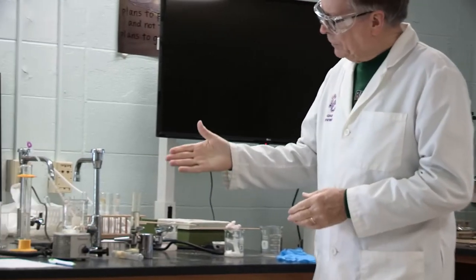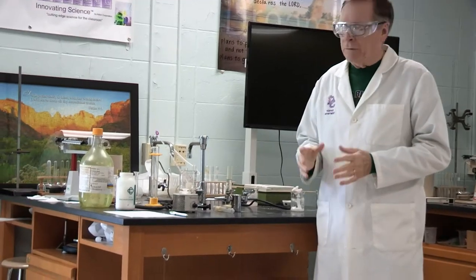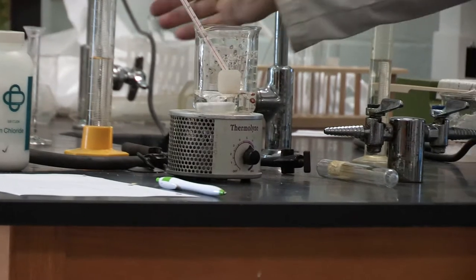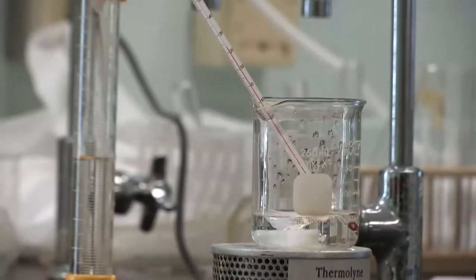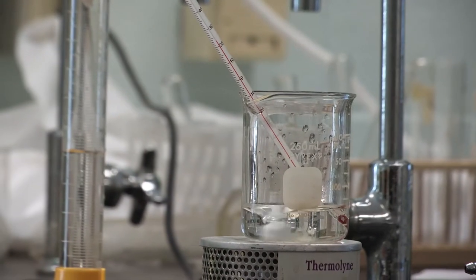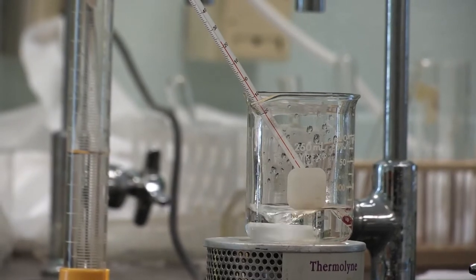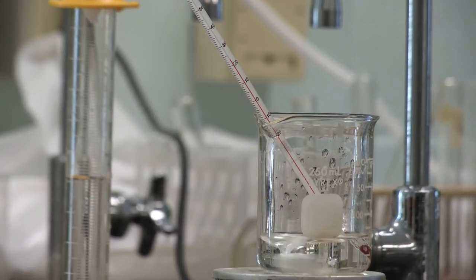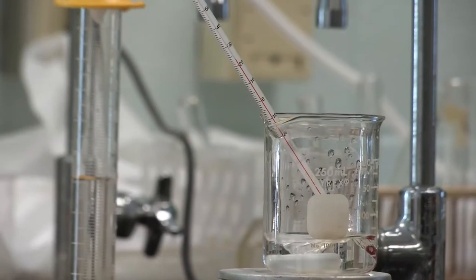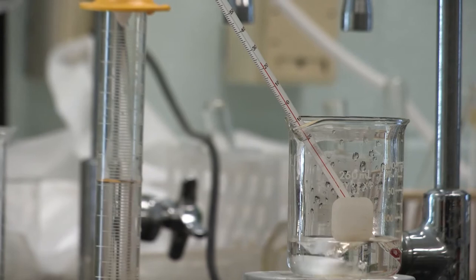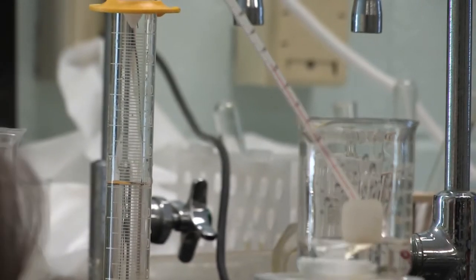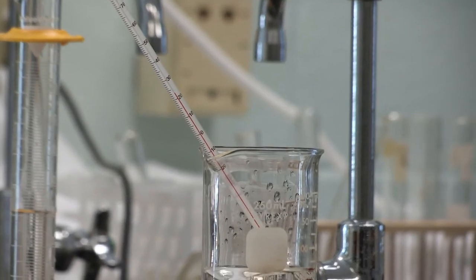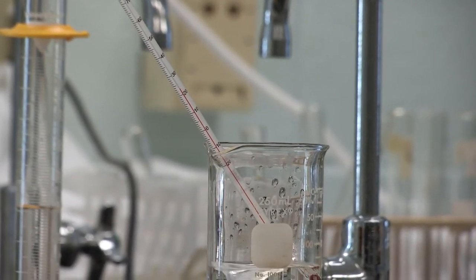Here's our setup. Here's a beaker of water. I have 50 milliliters. I have a stir bar in here, and I'm stirring it, and I have a thermometer in there to record the temperature. Can you see what the temperature is? It looks about 23. Let's say 23.